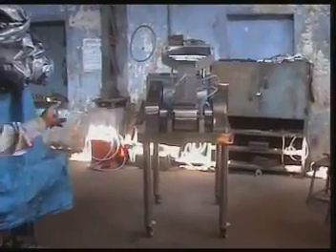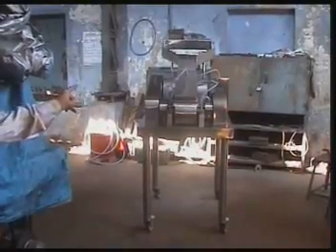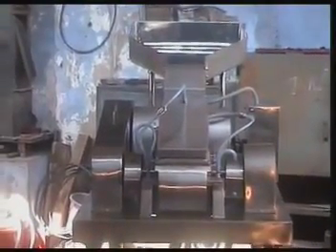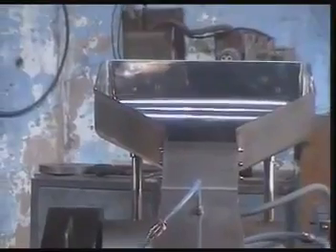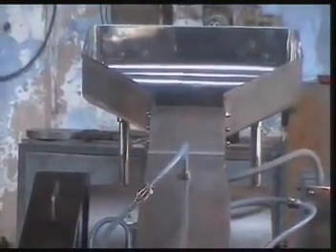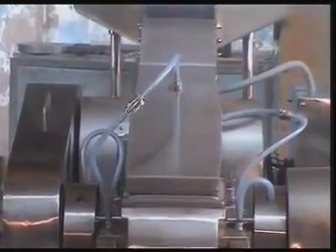This is the commuting mill, fully GMP with contact SS316 parts and a water jacketing system. It has a maximum output of 800 kg per hour depending upon the product or material. There are three types of commuting mills: one is multi mill, another is commuting mill, and another is oscillating mill.